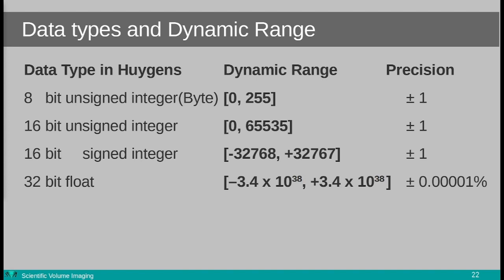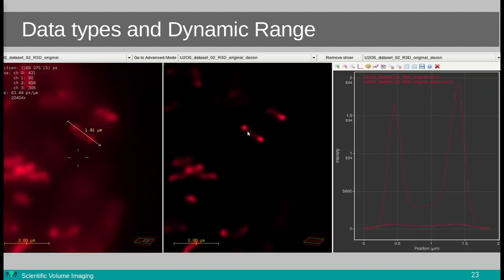After deconvolution, the intensities in your original image will also be more concentrated towards their most likely place of origin, making the object itself brighter. The highest value in your image could then well exceed the 65,000 intensity limit for 16-bit integer images. So for these reasons, the deconvolution result is also always stored in 32-bit floating point numbers. Even though the intensity at a single point in your image may be higher after deconvolution, the total intensity in the image will remain the same due to conservation of energy.